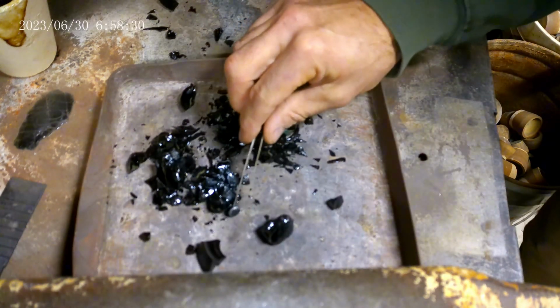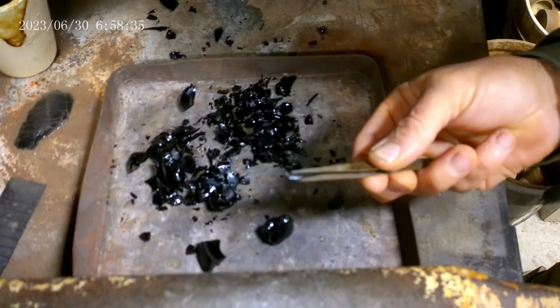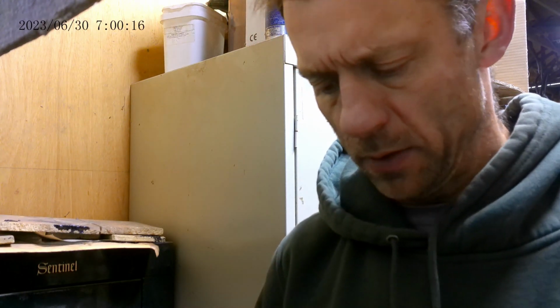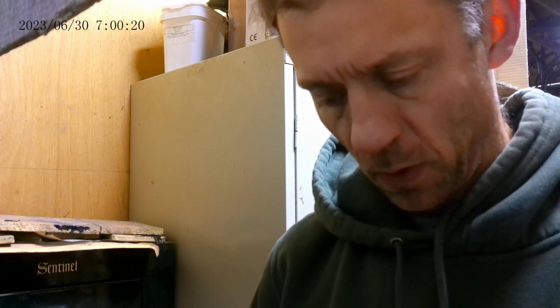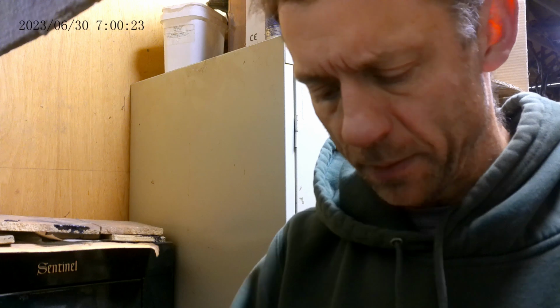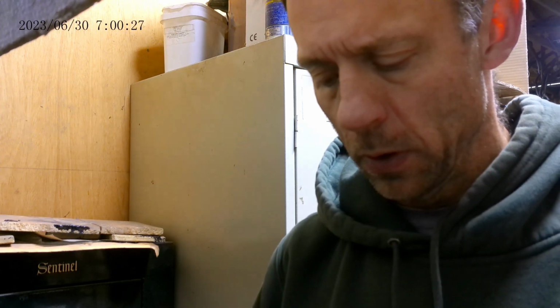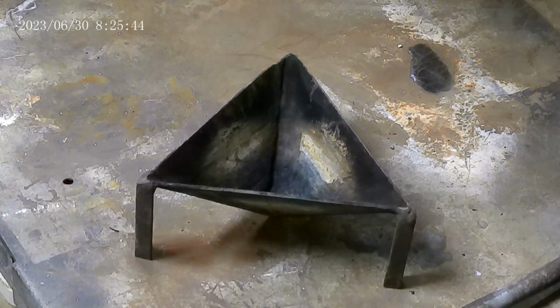But we'll go ahead and cupel this little tiny button, see how it turns out. Not good. Okay, so that little tiny lead button just shattered. So that did not go very well. So I'm going to re-smelt all this slag. Add some more flux. I'll probably put it in a bigger crucible and try that one again. Okay, let's try this again.